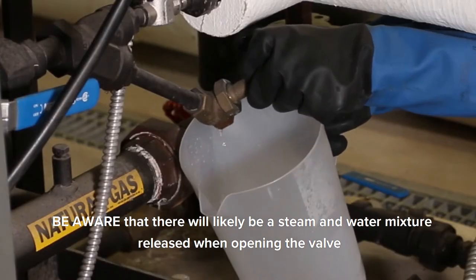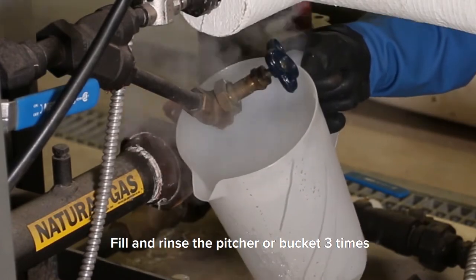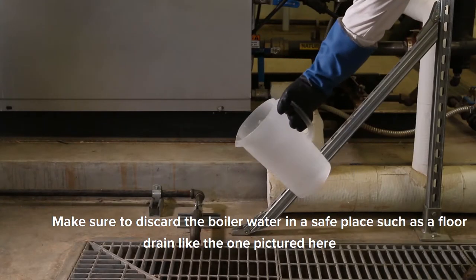Be aware that there will likely be a steam and water mixture released when opening the valve. Fill and rinse the pitcher or bucket 3 times. Make sure to discard the boiler water in a safe place such as a floor drain like the one pictured here.